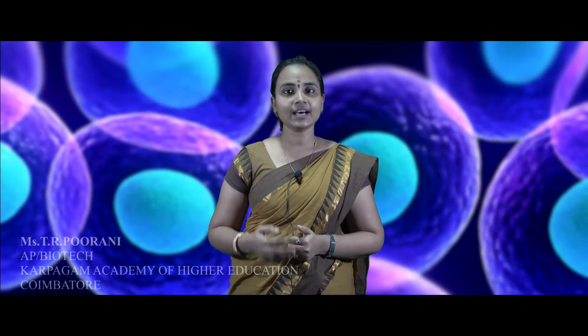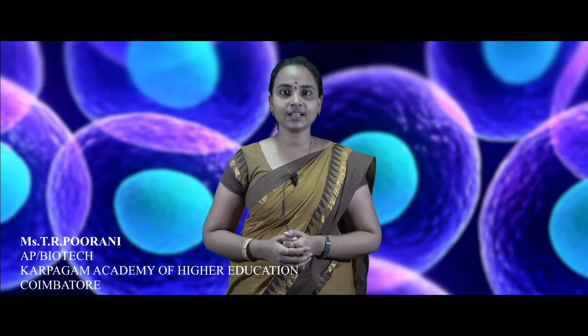Hi everyone. In the last lecture series, we saw in detail about ion exchange chromatography, and in today's lecture, we will see in detail about size exclusion chromatography and its principle and working mechanism.